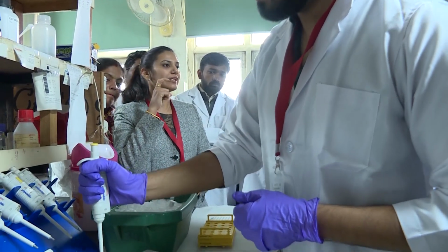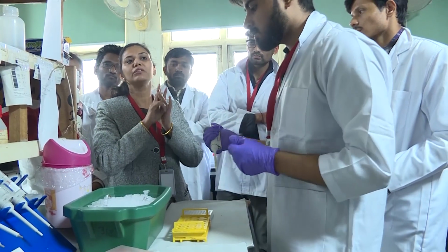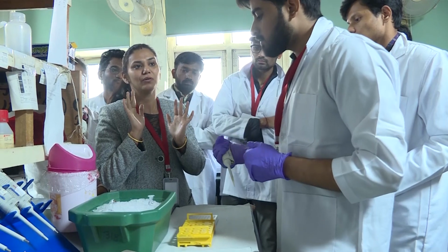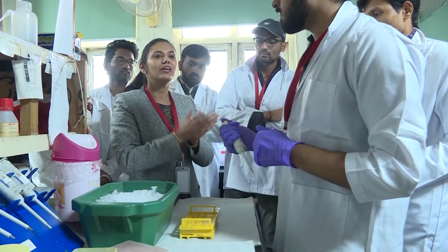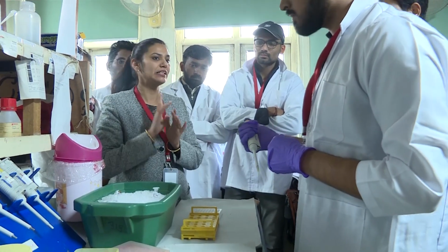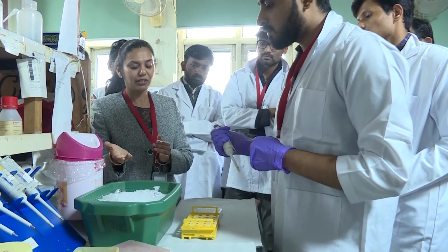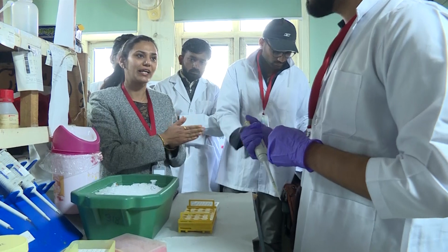Here we have made a common mix of SYBR and water, because these two things are common in all your samples, whether it is the endogenous gene, heat stress, control, or your gene. When you come to later steps, in some cases your primer will be different. For actin, you have to use actin primer.